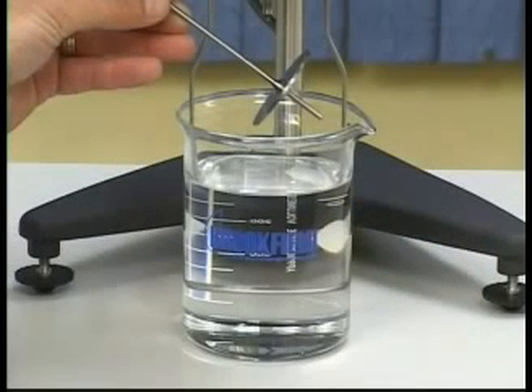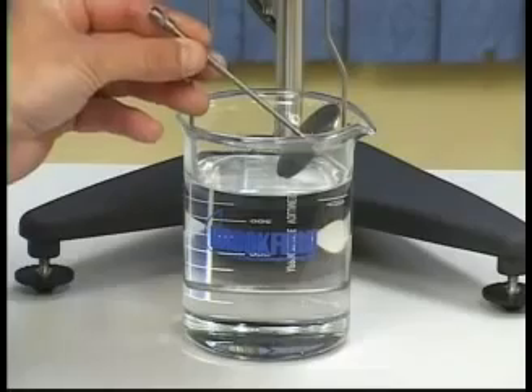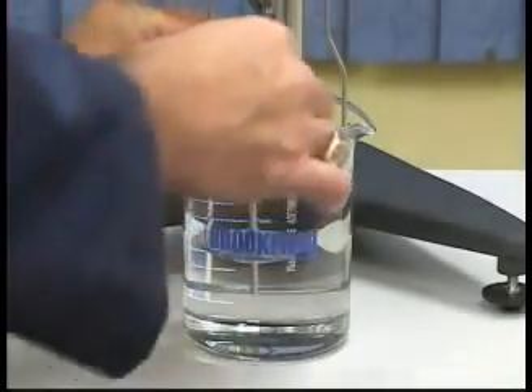To prevent air bubbles from being trapped underneath your spindle, tilt the spindle at a 45 degree angle as you dip it into your sample.